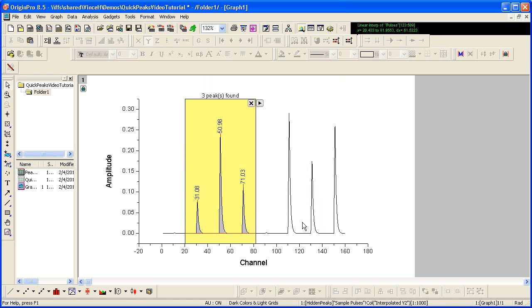Notice that peaks are found automatically and labeled within the region of interest, which is defined by the yellow boxed region.